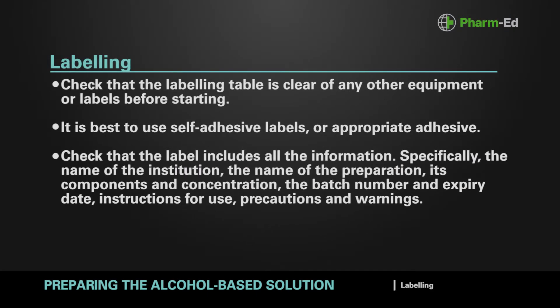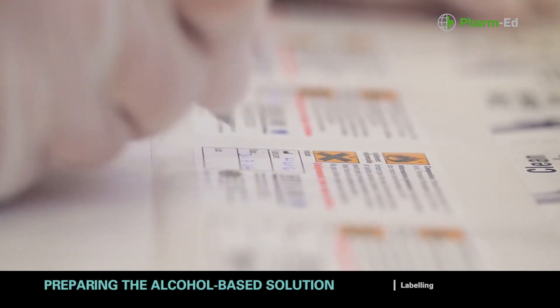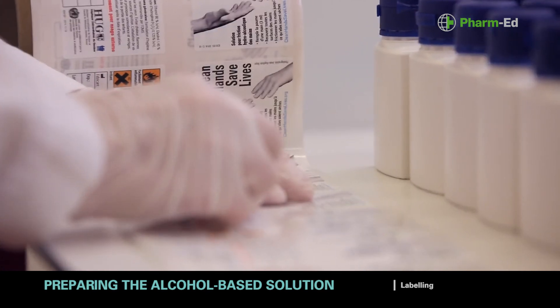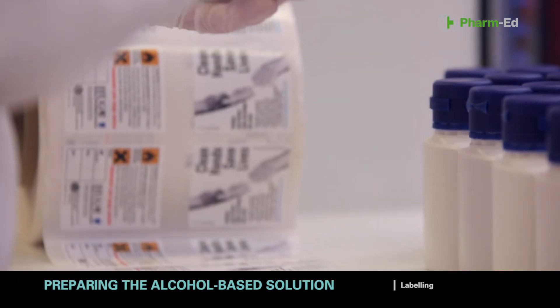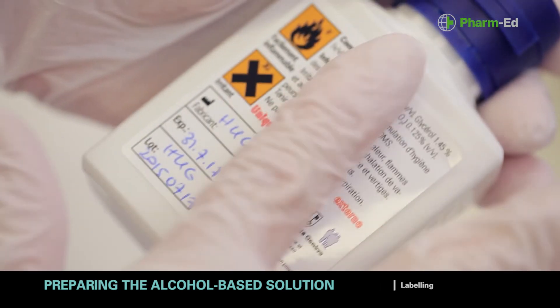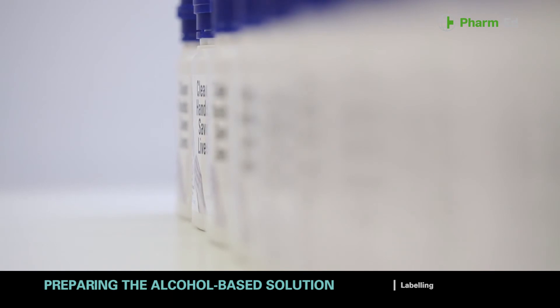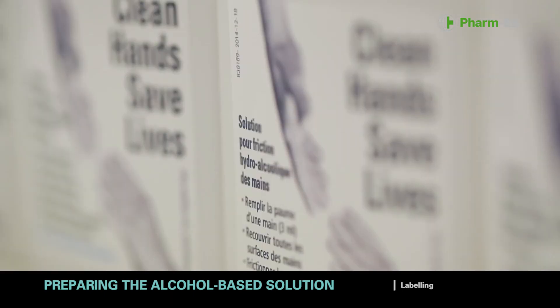Check that the labeling table is clear of any other equipment or labels before starting. It's best to use self-adhesive labels or appropriate adhesive. Check that the label includes all the information — specifically the name of the institution, the name of the preparation, its components and concentration, the batch number and expiry date, instructions for use, and precautions and warnings. Affix a label to each bottle so that the information can be easily read. Affix a label for the prepared batch to the production sheet. Write down the expected number of labels and the number actually used. Destroy any labels that were filled in but not used; this prevents them from being affixed to another product by mistake, reducing the potential for error.